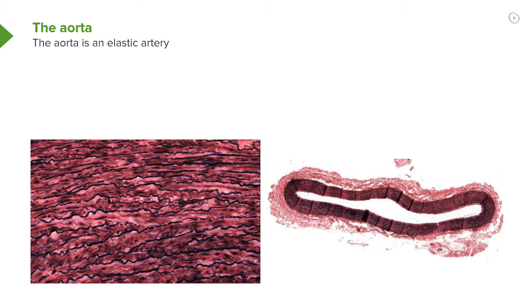Here is a higher magnification picture of this elastic tissue, and you can see the dark stained plates of elastica. If you look very carefully in that elastica, you can see that there are fenestrae, or small little gaps or pores between the elastic tissue — the sheets of elastic — which are branching.